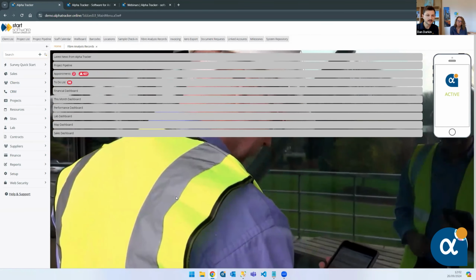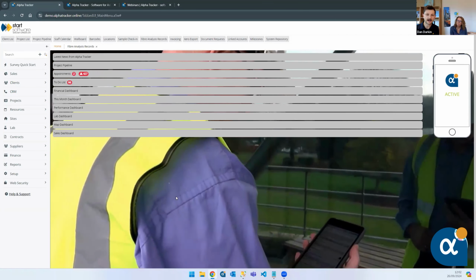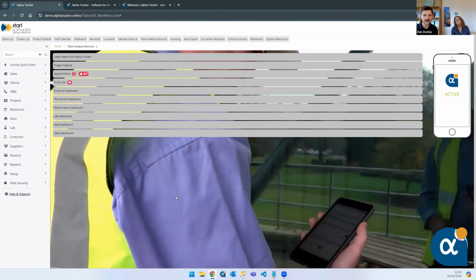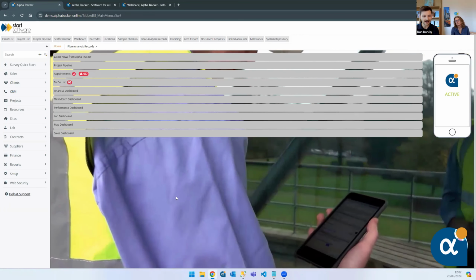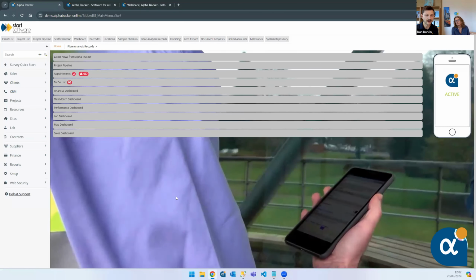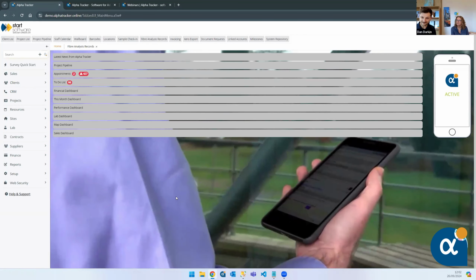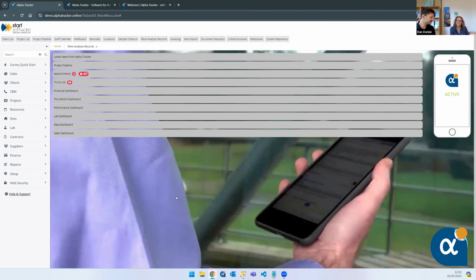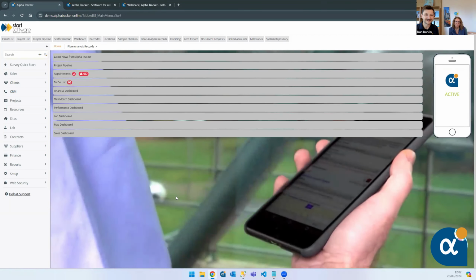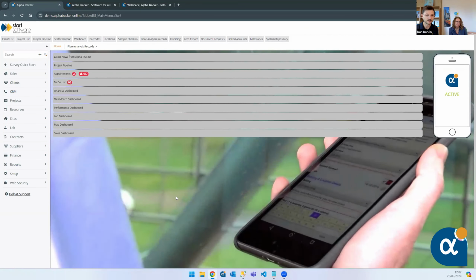And it basically gives you the visibility to see where a sample is at any point in its life. So you can see the samples with the surveyor, or it's possibly booked into the lab. And it just gives you that traceability to see where things are at. Some people might know it as sample traceability or chain of custody, something like that. Yeah, absolutely. Thanks, Kim. There are a few names for it, different terminology, but that's essentially what we're going to be running through today.